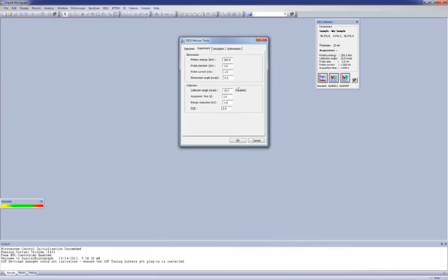If we go to the next tab, we can see experiment. Experiment basically refers to the illumination and collection conditions that are used for the calculation. For the illumination conditions, we have the primary energy, probe diameter, probe current, and illumination angle. And for collection, we have the collection angle. This is actually the semi-angle, as it is for the illumination, the acquisition time, the energy resolution, and the DQE.